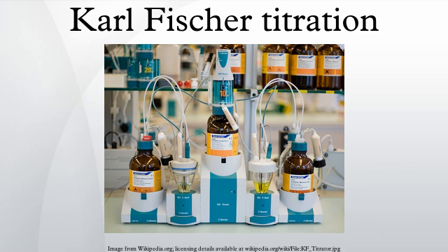Coulometric titration: the main compartment of the titration cell contains the anode solution plus the analyte. The anode solution consists of an alcohol, a base, SO2 and I2. A typical alcohol that may be used is methanol or diethylene glycol monoethyl ether, and a common base is imidazole.